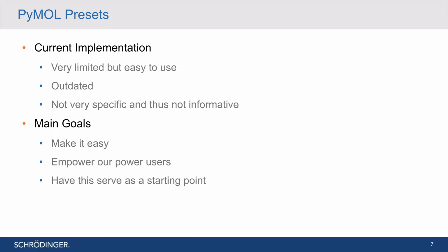What I mean by that, there's 2 separate components within that. The first component is that we want you to have a preset as part of your workflow, so that when you load in structures, you can apply a preset that puts it in a form that is useful to you, right? So the example that I keep going back to, let's say your lab is very focused on membrane proteins, right? Your entire lab focuses on membrane proteins, or something similar.